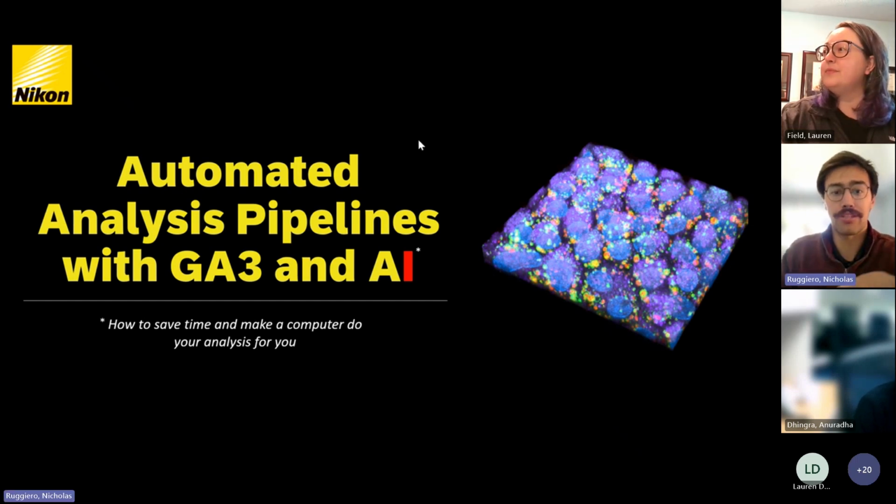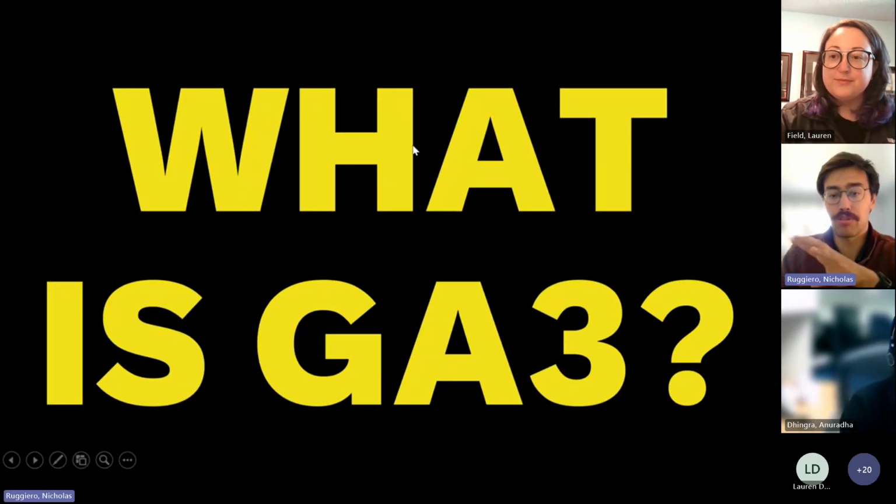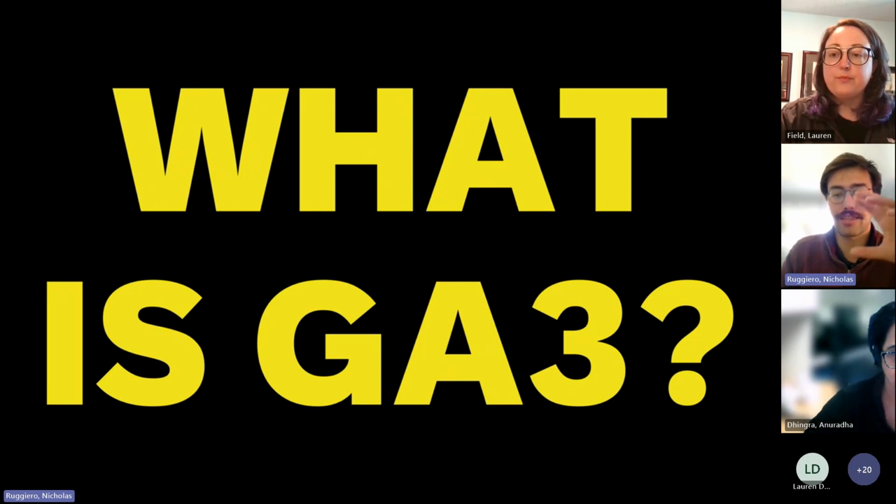The first thing that we're going to talk about today is what is GA3? Most of you have probably never heard of this before. It stands for General Analysis 3. It is Nikon's analysis tool that we use to create these automated complex analyses that help standardize some of our routines and get really nice data.